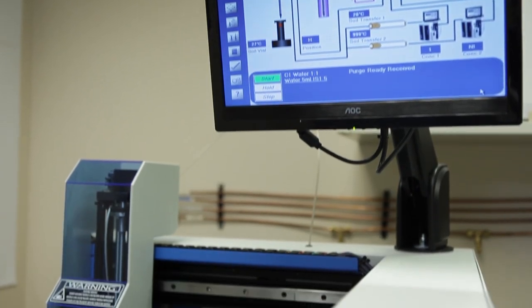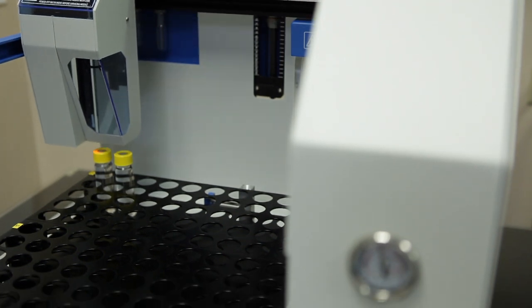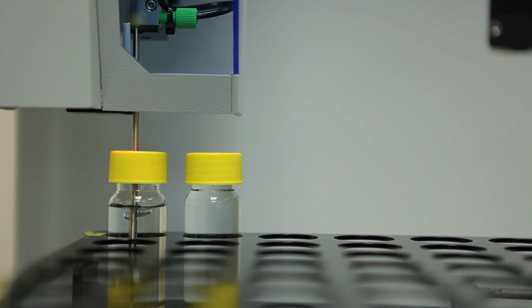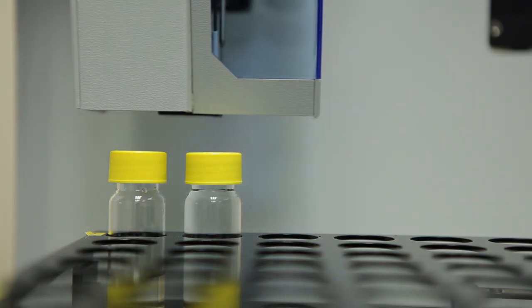The Centurion is made to be a robust and reliable platform and has been engineered to eliminate common errors seen on other systems such as lost vial or syringe and elevator errors. The system also eliminates a lot of sample manipulation and transport by sampling from the vial while it remains in the tray.